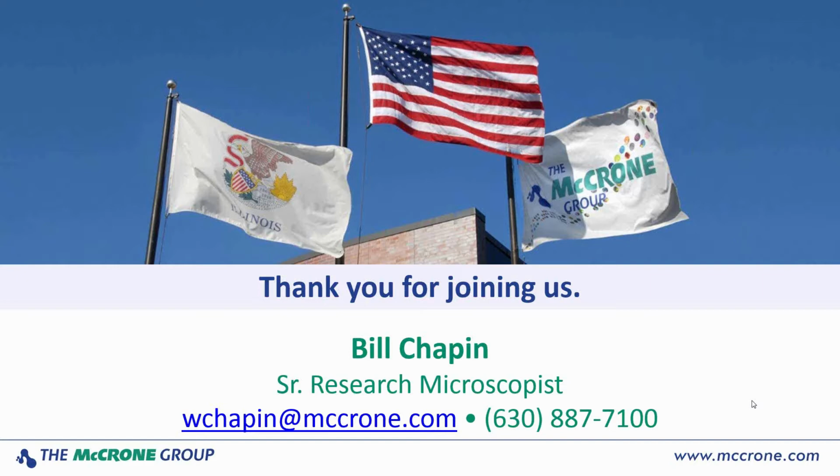Bill kind of answered the one that Jason posed early on in the presentation about how you go about creating your own tungsten needles. Bill referenced our website. There are a few places you can locate that. One is Modern Microscopy, our online free journal, and there's a section in there called Prep School.